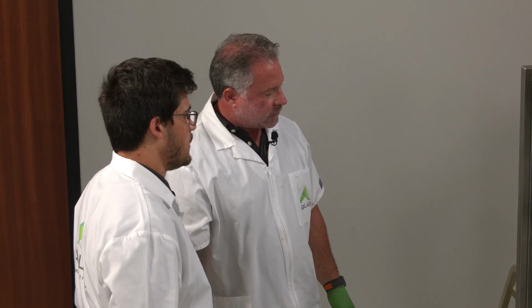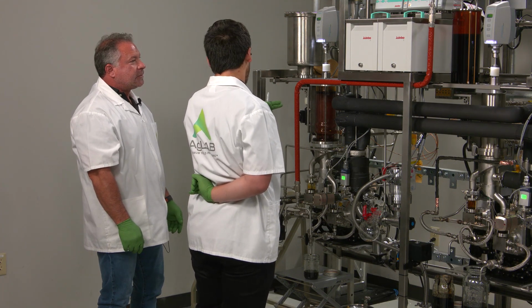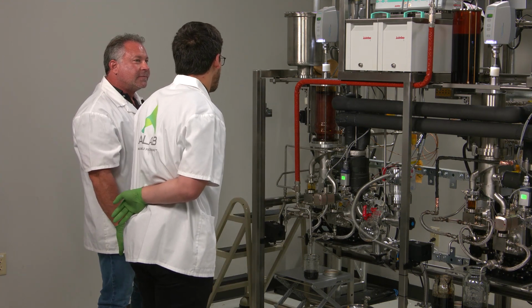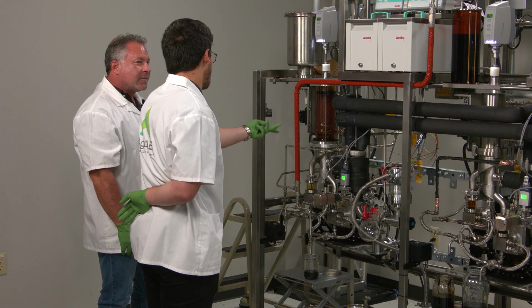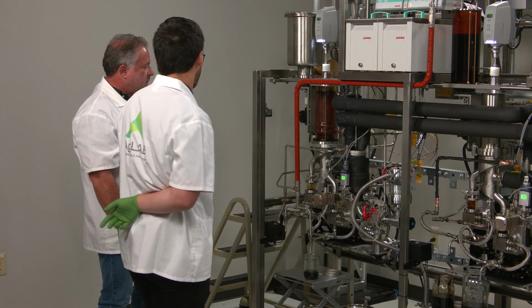So then what would happen if we took this condenser and, if we're catching terpenes, we can clean those up and sell those. So what's stopping us from collecting everything that we can? Why don't we set that to negative 20 or 0 degrees to be more efficient?